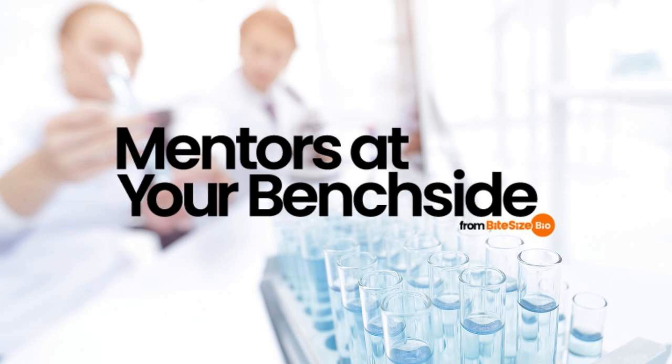Under the microscope, live cells will be clear, that is, unstained, while dead and degraded cells, nuclei, and cell debris will be blue/blue-black. To prevent the quality of your trypan blue from complicating your nuclei counting, inspect a few microliters under a microscope. If you see some crystallites or contaminants in your trypan blue solution, try centrifuging it at a relatively high speed. Isolate the top portion of the solution, filter it, and re-inspect it to see if it's any cleaner. Another option is to run the trypan blue through a 0.2 micrometer filter to remove the large debris.